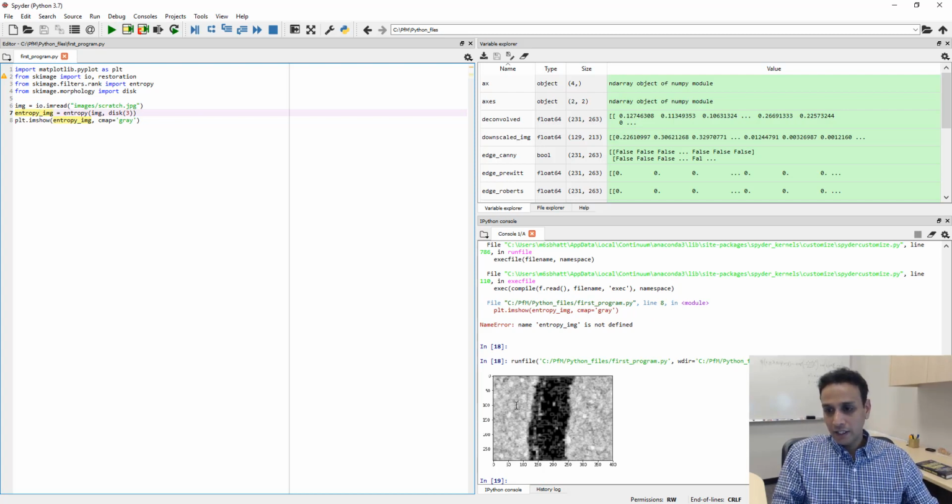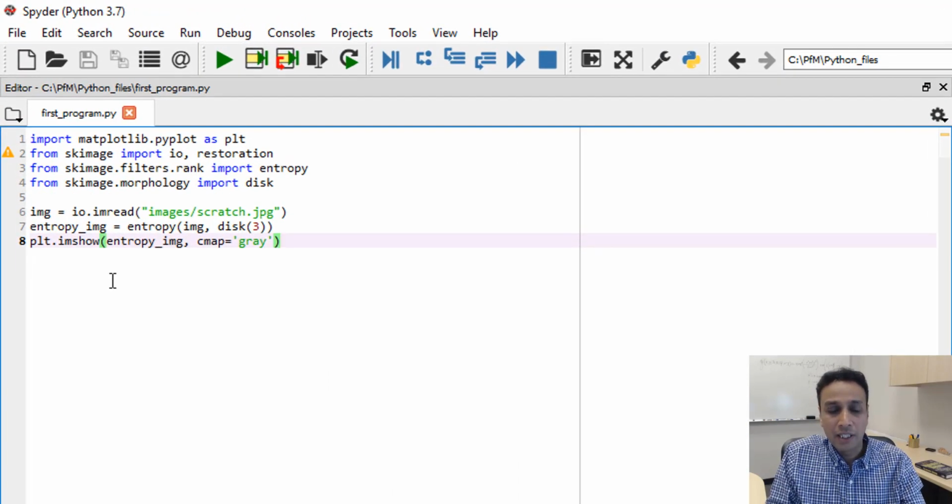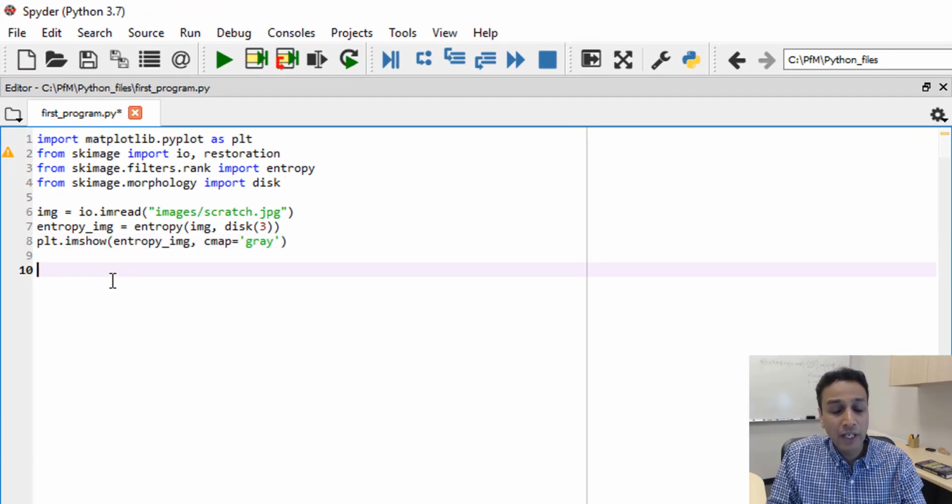And there you go. As you can see on the left hand side and the right hand side where we have a lot of cells, it's showing a pretty bright region, and in the middle it's pretty dark. Now we need to add another step. We need to take this image and process it further to highlight this scratched region. So what do we do now? We can apply a threshold to segment these two regions. That's pretty much it. But which threshold to apply?